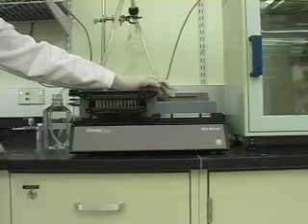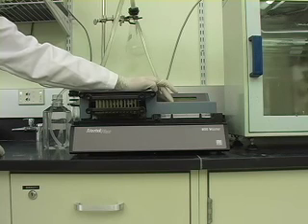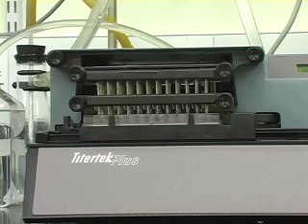Wash the plate with an ELISA washer to remove excess coating antibody. Remember to turn on the vacuum for the washer beforehand. To remove drops of water left on the plate after washing, tap the face-down plate against a paper towel.